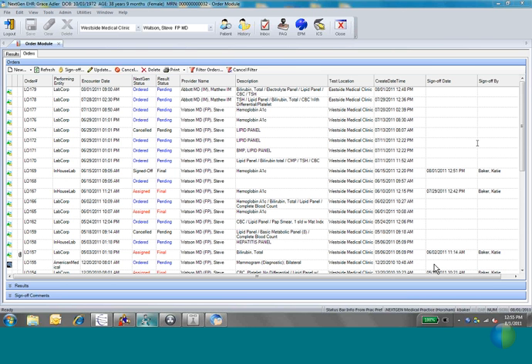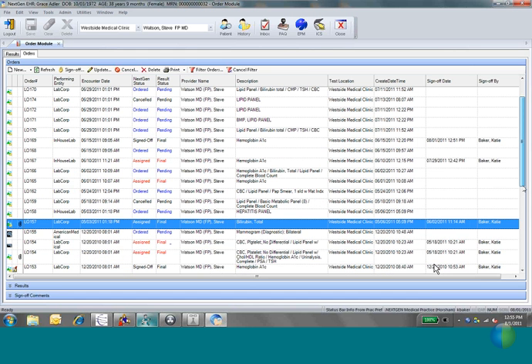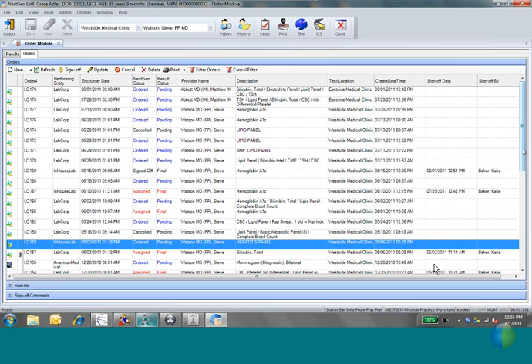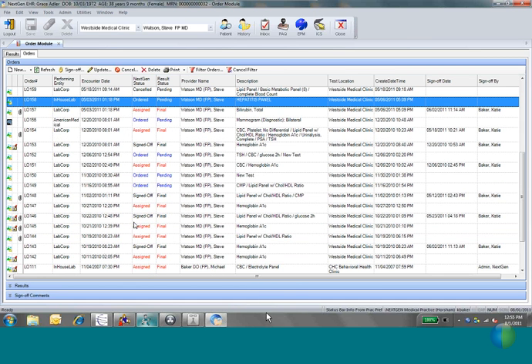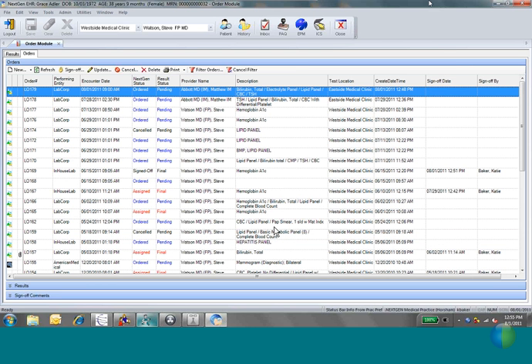Another question, we can see the paperclip. Oh, okay, we'll get to the paperclip in a second. The paperclip is an attachment to the order, so that's the one you're talking about down here. A couple of mine have paperclips on them, so we'll get to that. Some of them also have these little post-it notes on them. So there's a couple of icons that are determined by the results. Before we go on to the result side of things, are there any more questions about placing orders? And I'll give you a chance to type that in.